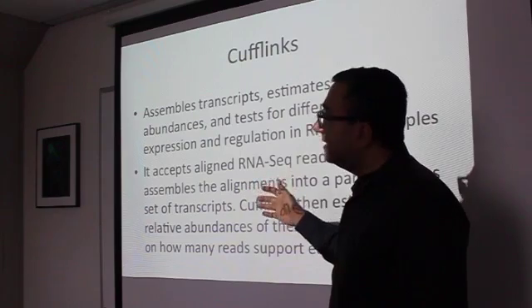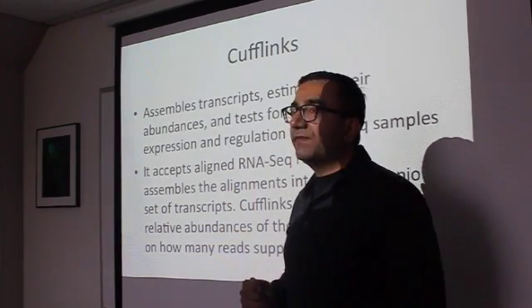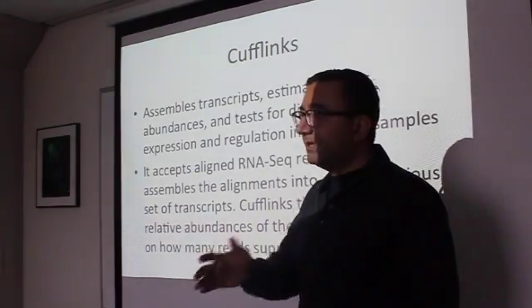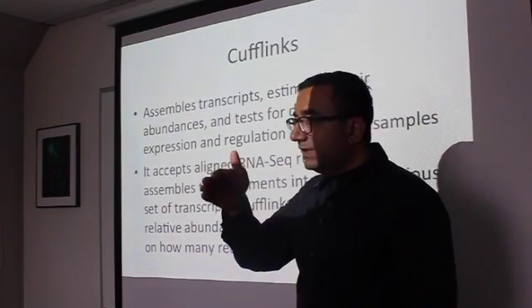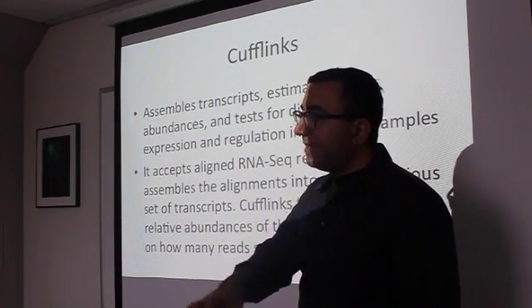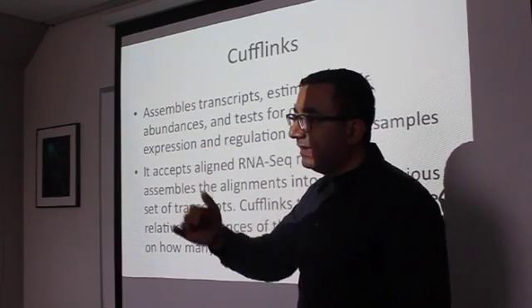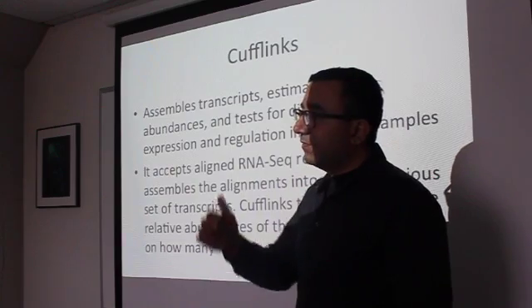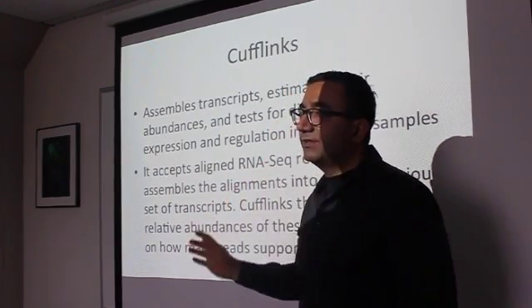The advantage of using Cufflinks and Cuffdiff is that they're written by the same person, or the same group at the very least. So they have a very streamlined way of going from accepted_hits.bam to using Cufflinks to using Cuffdiff. It's just basically 3 lines of code. Go from one to the other to the next, and you're done with your differential expression.